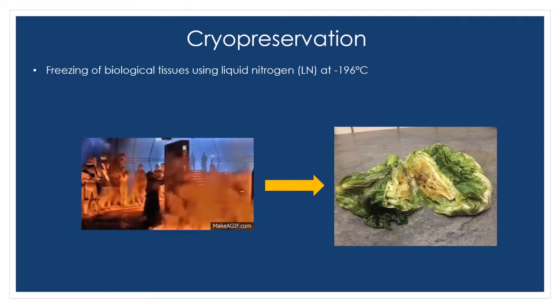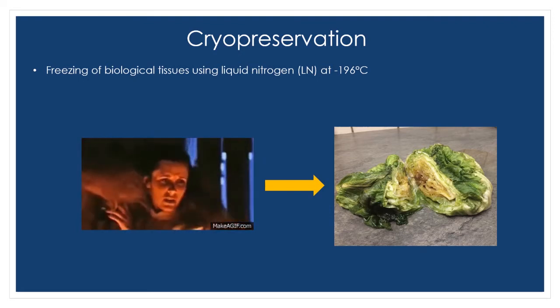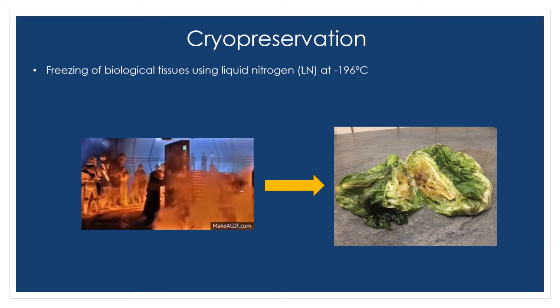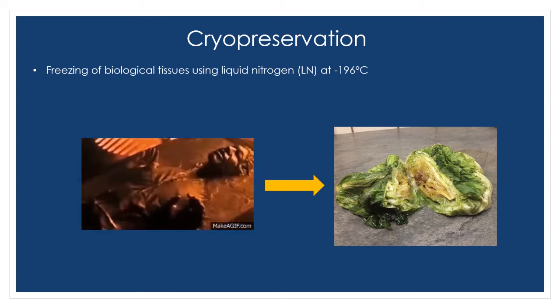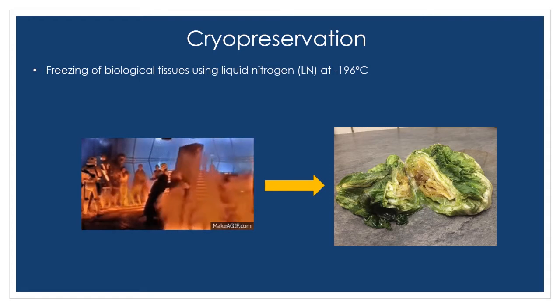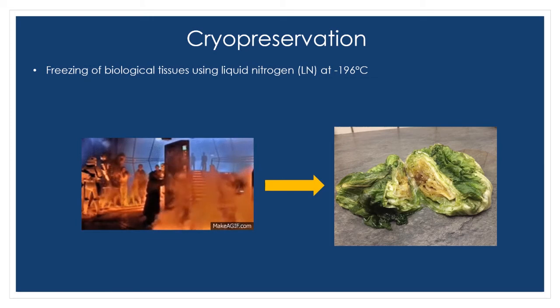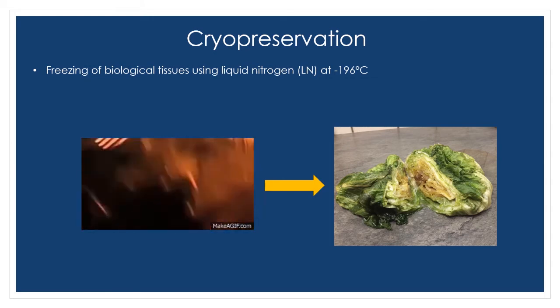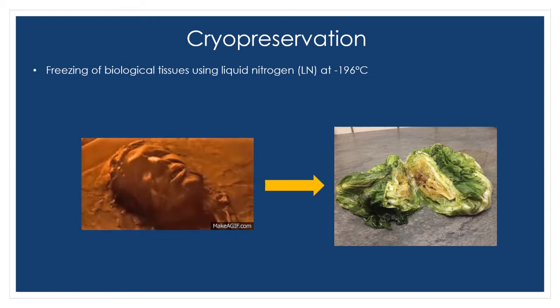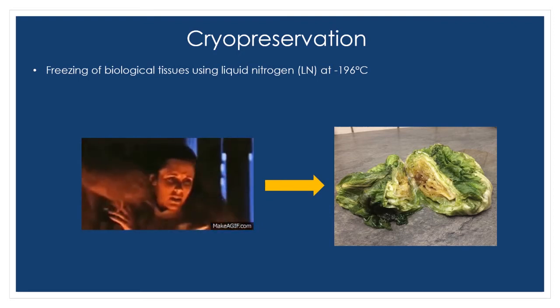So some species can survive just being straight away exposed to liquid nitrogen temperatures, but these are usually plants from really cold environments where they naturally have to survive freezing every winter. Obviously in Australia these species are few and far between. So we have to do something else to the tissues to get them to survive freezing.